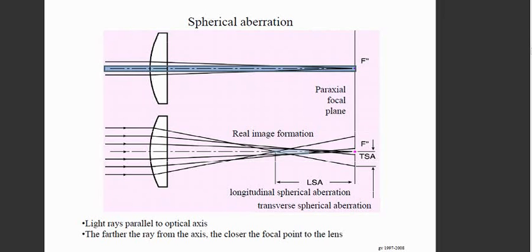And when there's more than one focal point, like here, you can see there are two focal points, you will not have a clear image. So explaining this real quick: due to imperfections in the lens system, a spherical aberration may arise where rays that are entering the lens further away from the optical axis are refracted at a closer focal point.